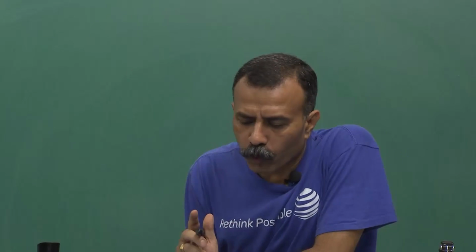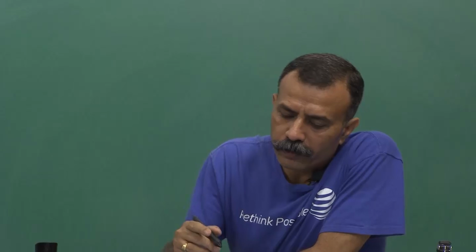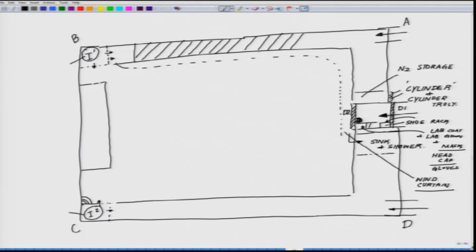Now, some people, what they do something very interesting. They kind of split the lab into two parts, like with the main frame like this, okay, at two levels. So, this is the level. Say for example, you can make it of glass or something, or you can use even these walls for your storage or other purpose, or you can keep a microscope on these tables.